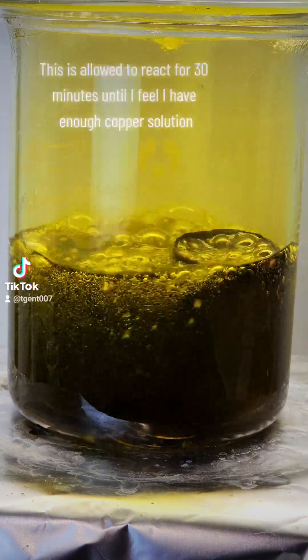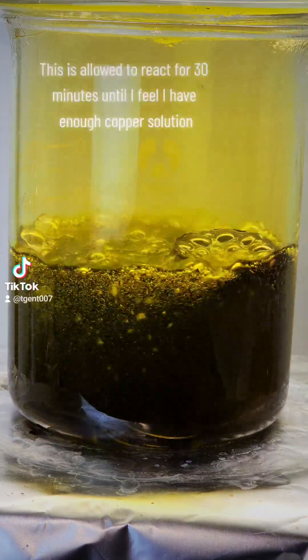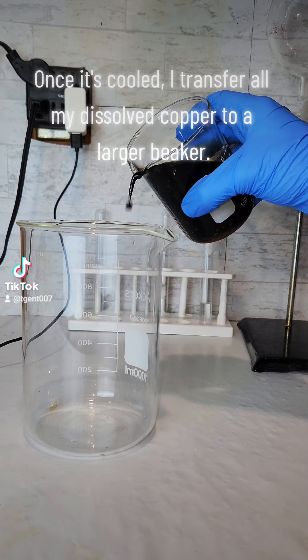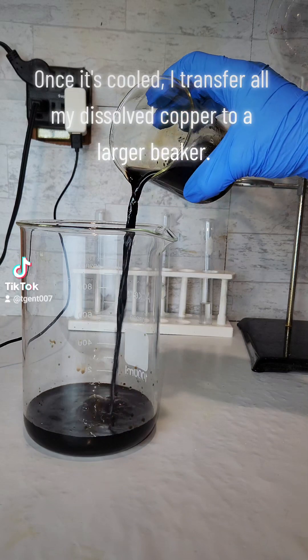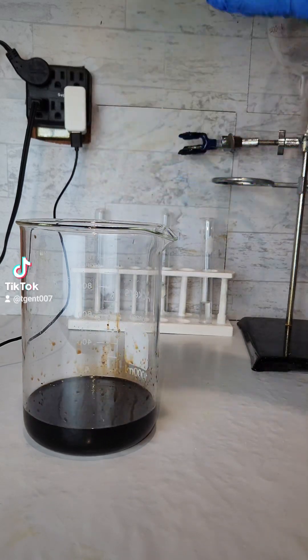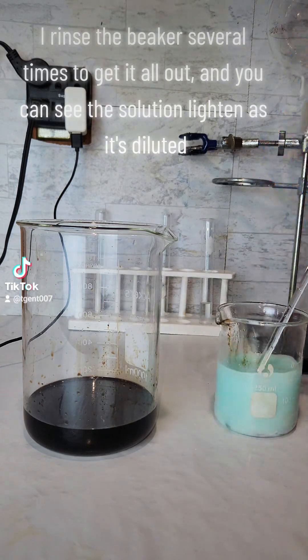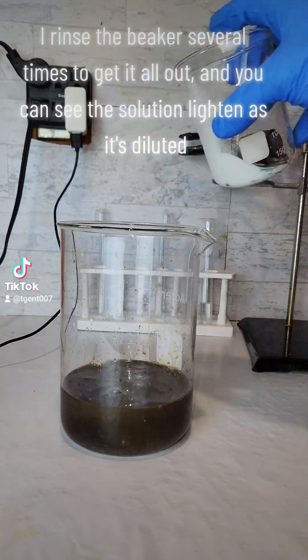This is allowed to react for 30 minutes until I feel I have enough copper solution. Once it's cooled, I transfer all my dissolved copper to a larger beaker. I rinse the beaker several times to get it all out, and you can see the solution lighten as it's diluted.